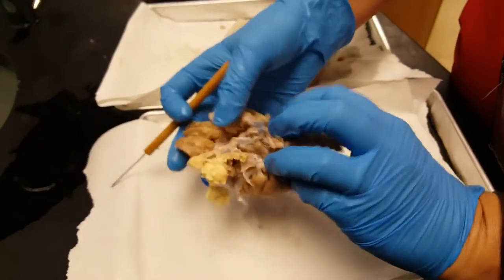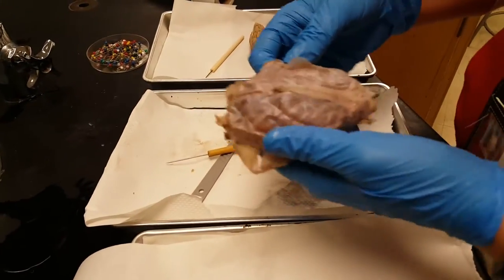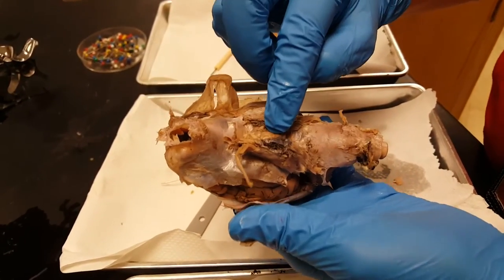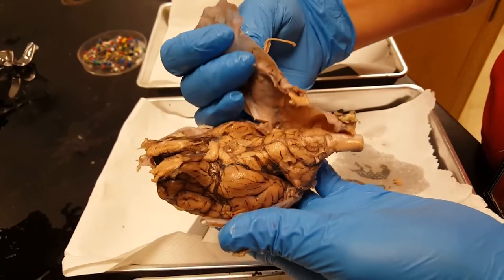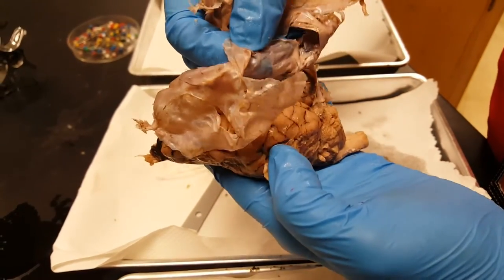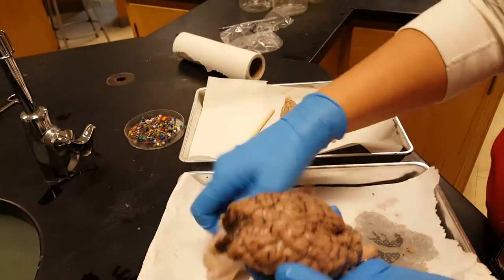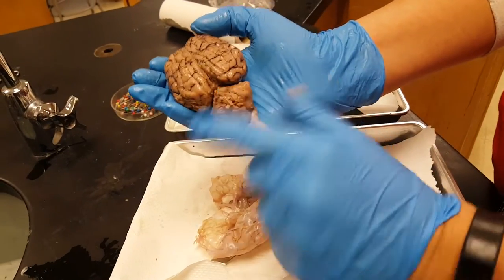The first step is to take off the dura. With careful work you can get it to come off all in one piece. Remember there's your pituitary — you're going to lose that when you pull off the dura mater. I already cut this, so that's why it's coming off so easily. Now you can see the dura is just this leathery covering, and now you can see the cerebrum and the cerebellum.